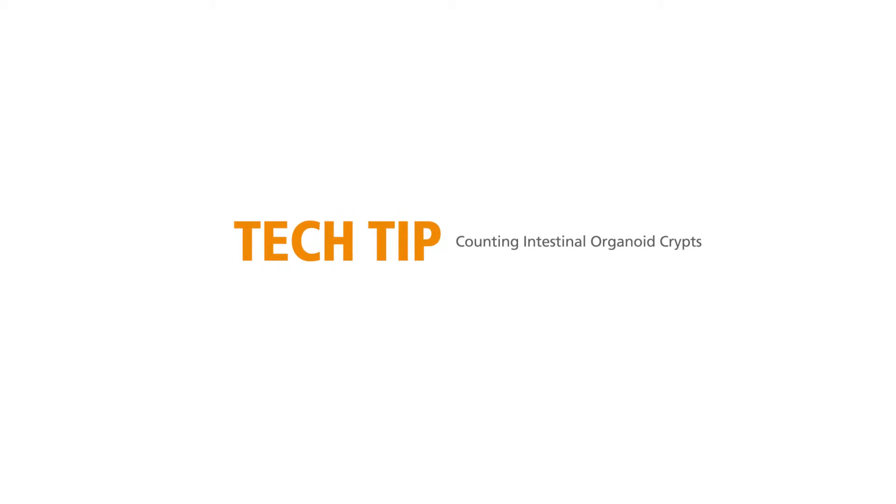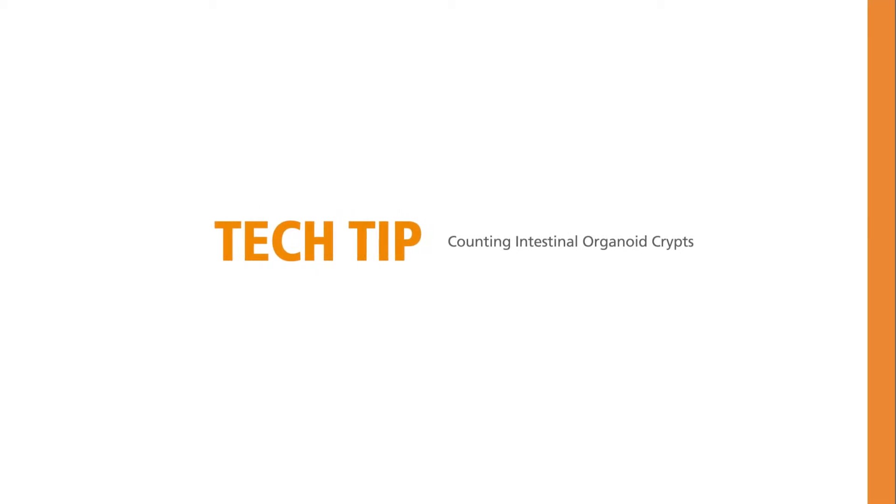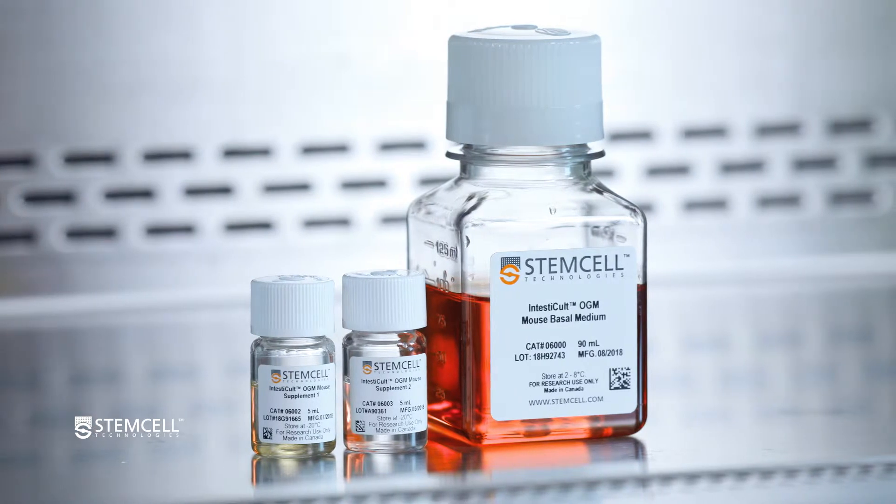Let us demonstrate how to count intestinal organoid crypts when using intestinal organoid growth medium for mouse organoid culture.